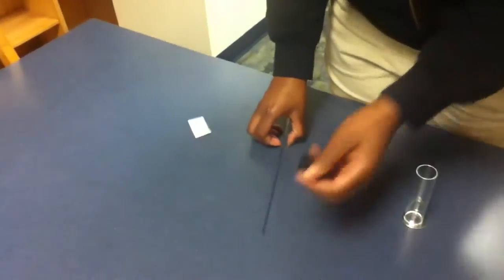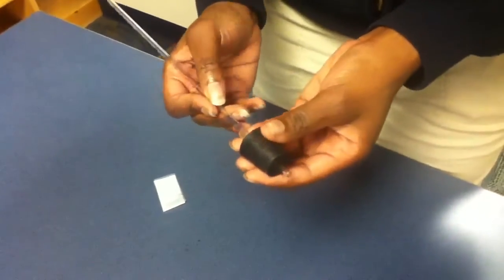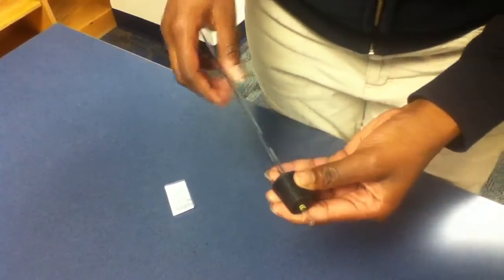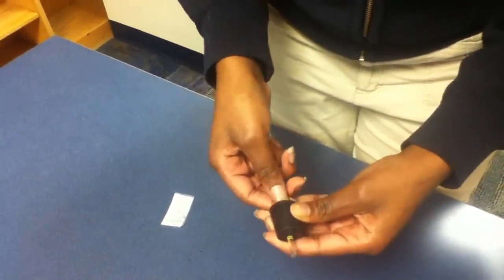Next, take your rubber stopper and your glass pipette. Put the stopper on the glass pipette just to show the yellow tip right here. Then you can either leave it on or take it off — just remember where the stopper stopped at.